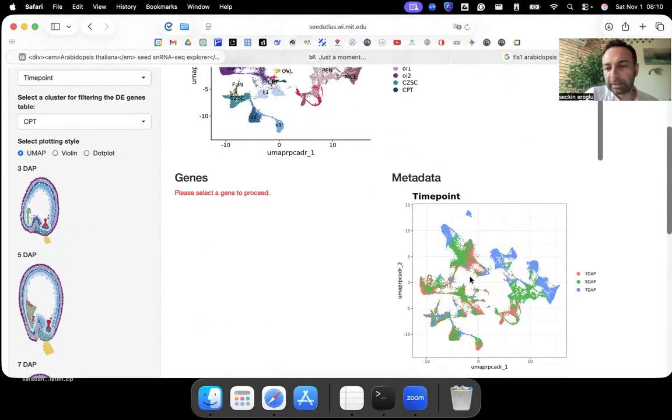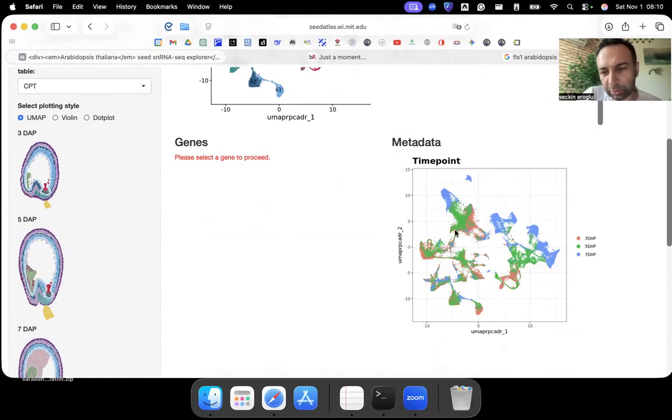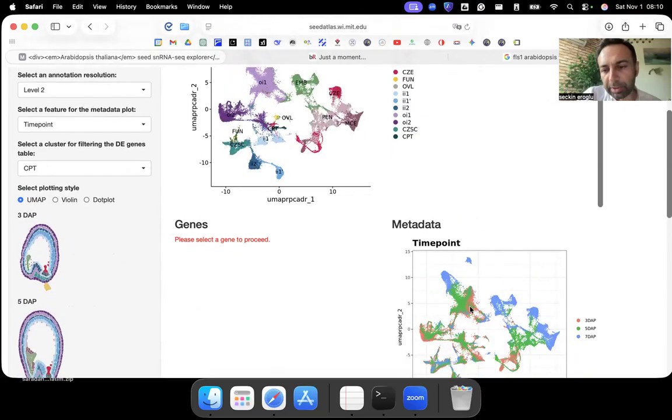And you can see they are grouping, the expressions, the similarity of expressions. They are grouping in that 7 days is more similar to 5 days. The 7 days of OE1 is more similar to, if this is OE1 again, probably yes, because it has the same shape.